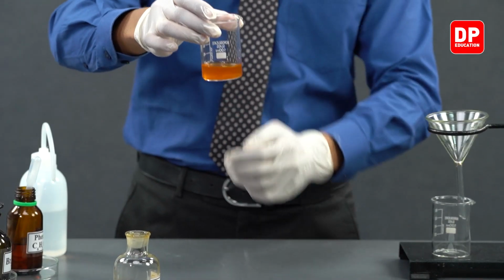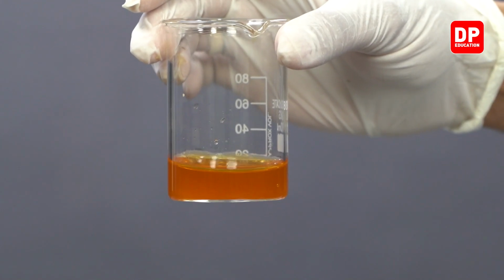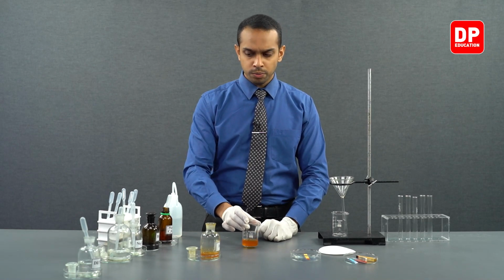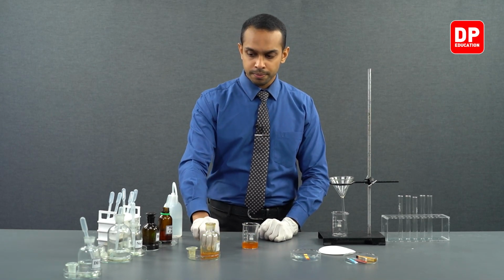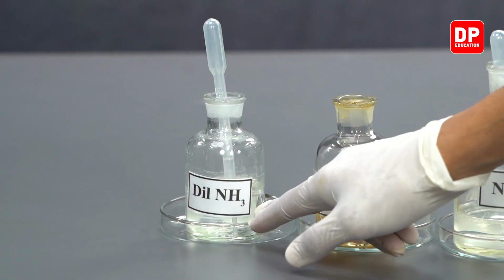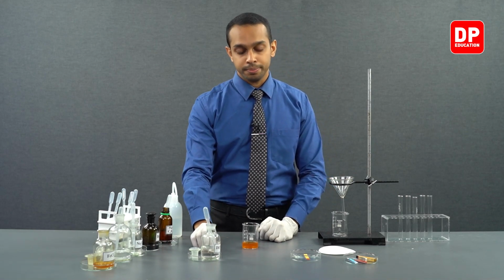As you can see, you can observe the orange-brown color very clearly. Now, to this, we will be adding dilute ammonium hydroxide or dilute ammonia.